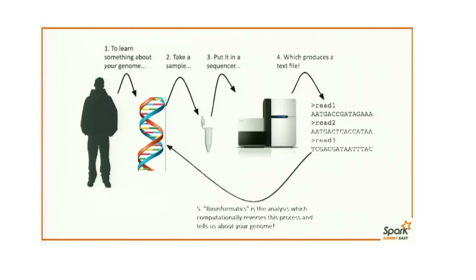And the total sequence presumably will tell us something about you, your biology, diseases you may be suffering, other kinds of diseases like cancer. The last 20 years of cancer research have revealed that cancer is basically a disease of the genome. So understanding the genome of your tumor, if you have cancer, is an important step. So that's what the sequencer spits out, this line-by-line string. These are called reads of A's, T's, G's, and C's, these strings, hundreds of millions or billions of these things.